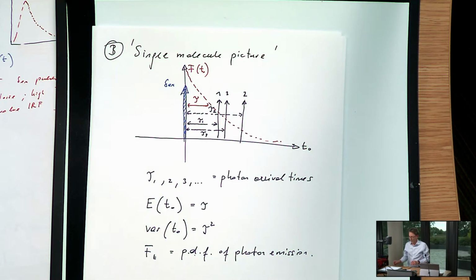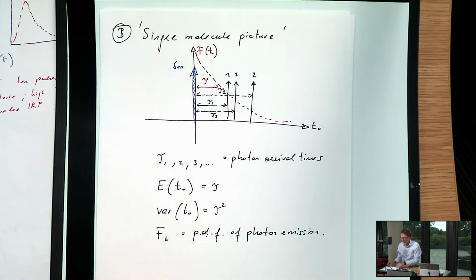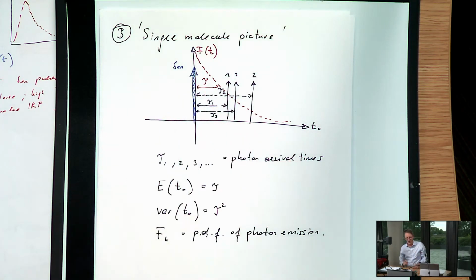Okay, so what we do is we just put these delta function pulses in, but unfortunately, of course, you cannot generate them physically. Although you can make very short light pulses, and you can get as close as you want with delta functions, any system, unless it's very, very specialized, will have a distribution.